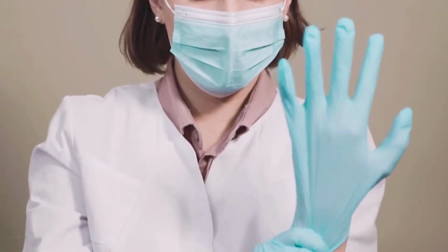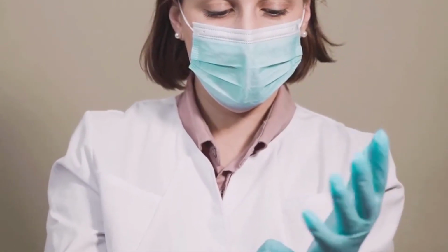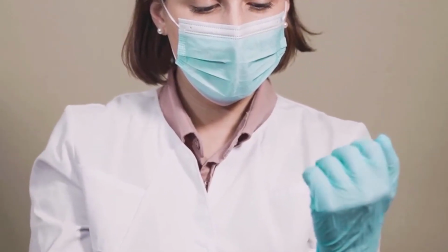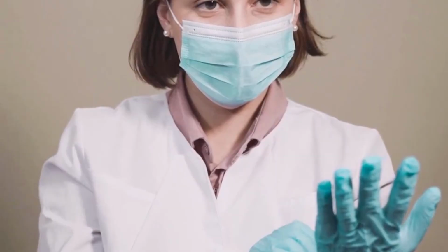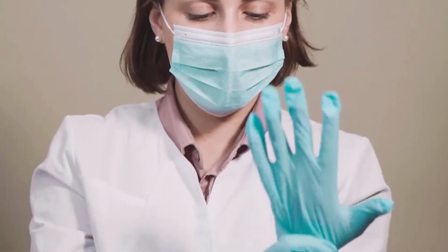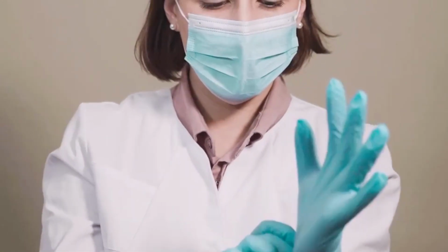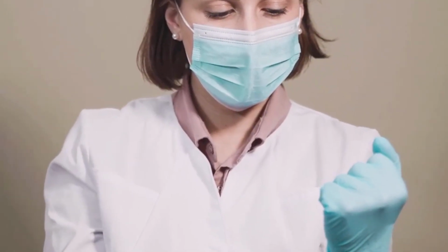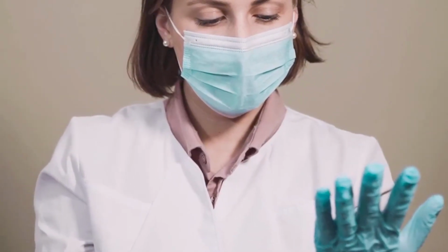Remember, PPE is effective only when used correctly. This means putting it on before contact with blood or bodily fluids, and removing it carefully to avoid contamination. You should avoid touching your face, your phone, or personal belongings while wearing gloves. Gloves must be removed and hands washed before touching clean surfaces, documentation, or other equipment.